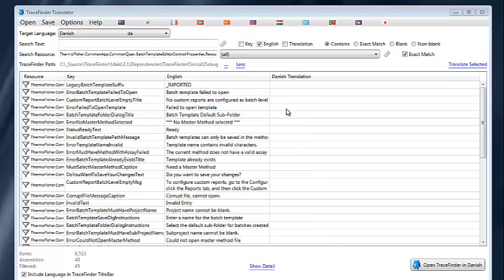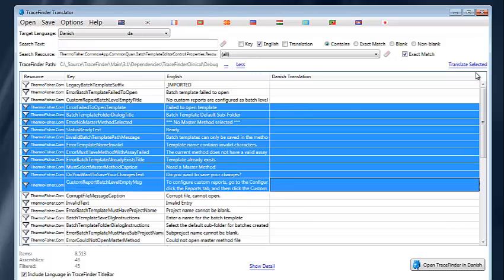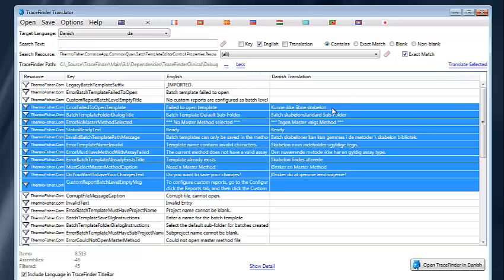Note that there is currently a maximum of 500 on the number of translations that you can apply, as this service does cost money to run, but it is a very small amount, and that maximum amount can be adjusted.